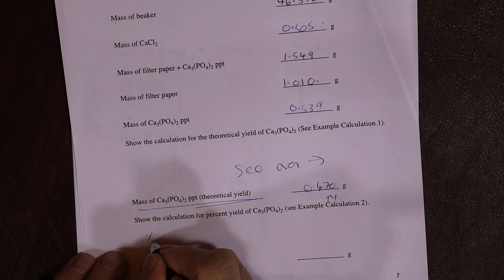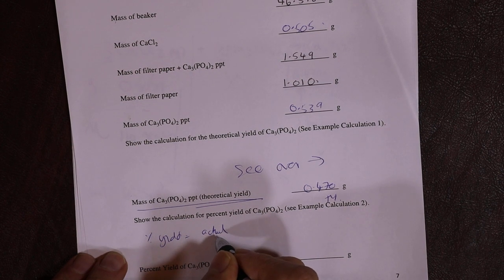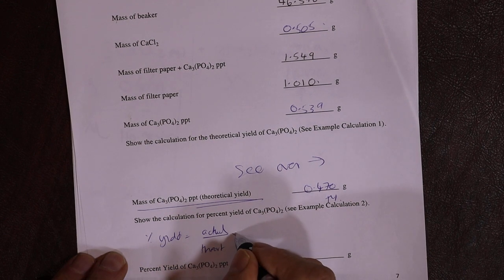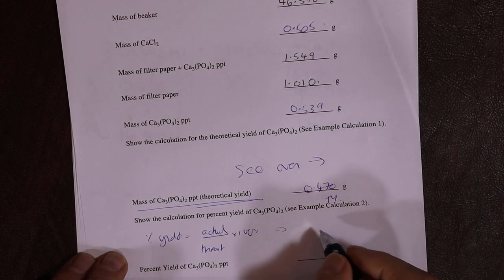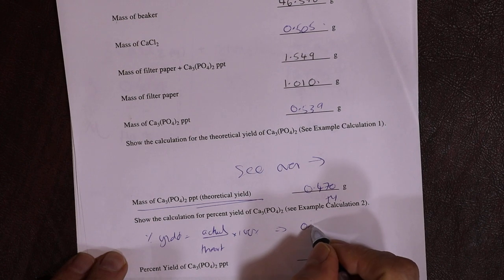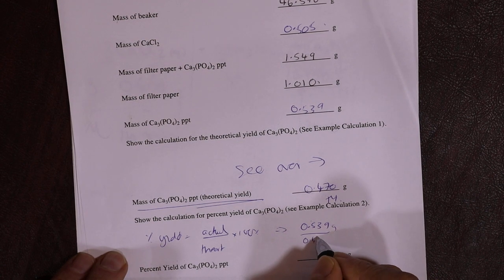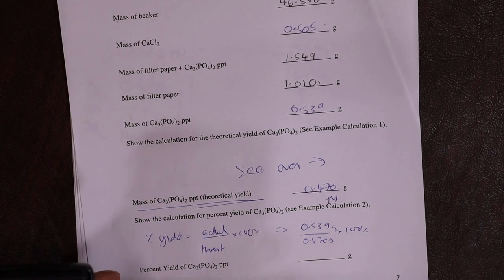So the percent yield is the actual, what you got out of the oven, over the theoretical, what you should have got, times 100 for a percent, which equals actual 0.539 grams over theoretical 0.470 grams times 100 for a percent. It's going to be over 100, but what is it?